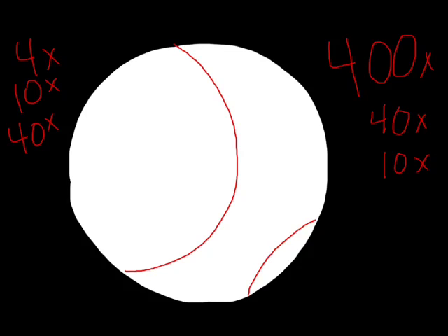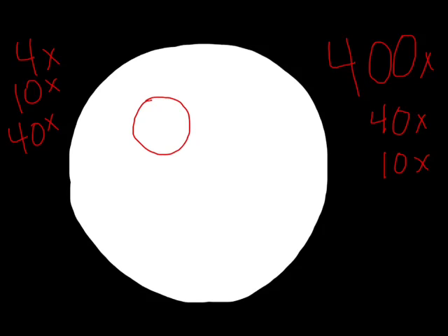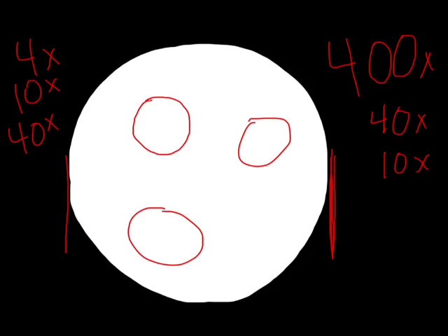And if we go back, think about what we just did, went from these smaller cells having a known field of view, which we've determined, talked about in class, from here to here, what we can actually see, 5,000 microns.